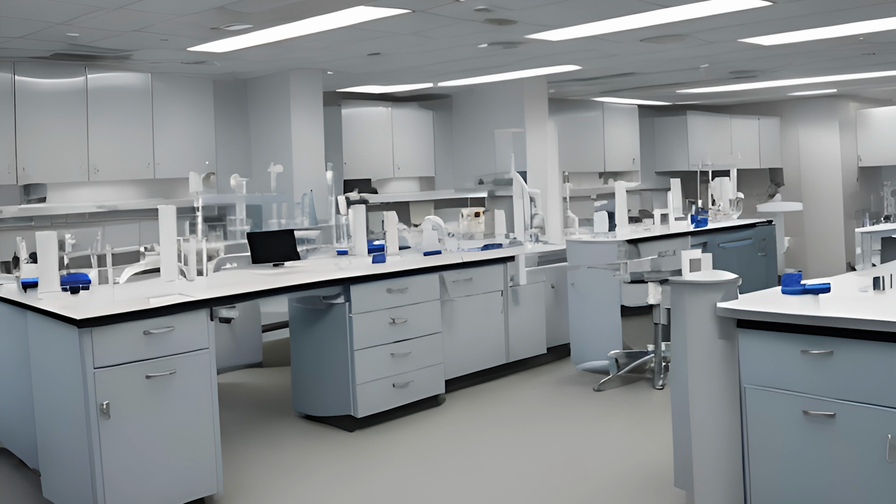Things like that. This inspection may be a regular inspection, or it can be as the result of a complaint. Someone could let them know that the laboratory is not performing work safely, and OSHA will come by to verify that claim. The big one for the laboratory is the College of American Pathologists. The College of American Pathologists is our accrediting agency. It is the end-all, be-all for how we think of whether or not it's a good lab.